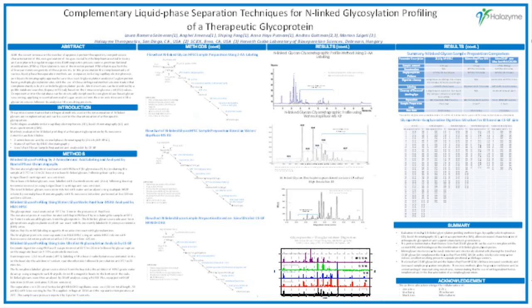I know in our CROs, we constantly have manufacturing lots that they're testing for us, and also stability in our stability program. For some of our programs, we include glycans. As we ramp up with some of our QbD testing, we do end up getting hundreds of samples at a time. So it really varies. Sometimes we test 5 in 1 week, and sometimes we could test up to 100.